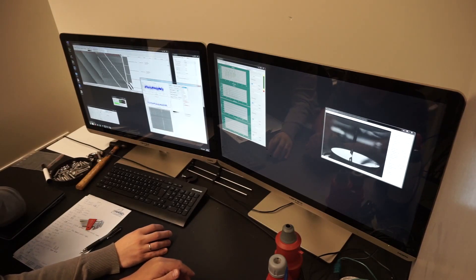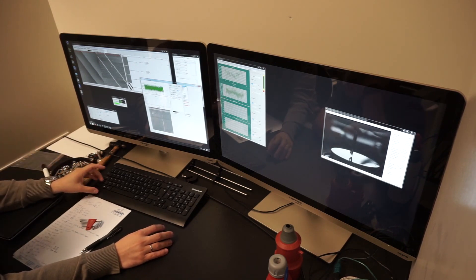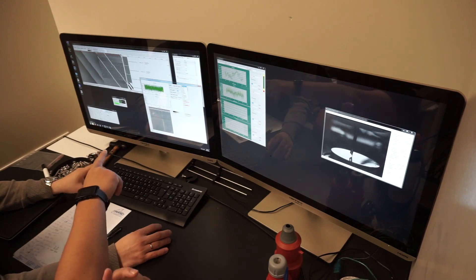So this was before. It was only in top of Berkeley because in current it was no noise. It is higher. Before it was like 4 times.